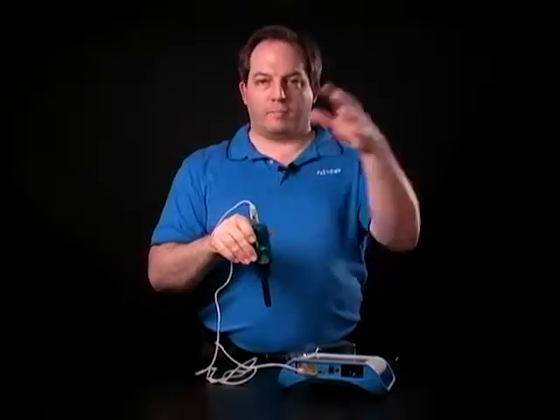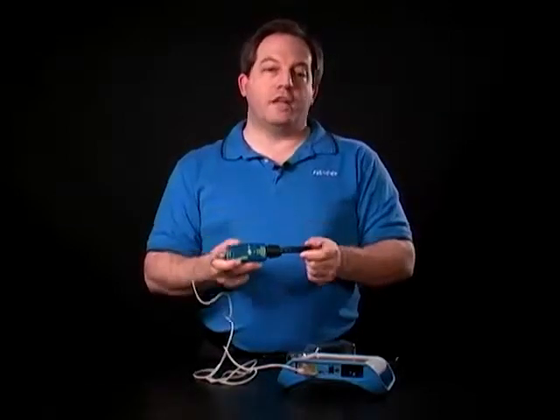Always try to keep the sensor away from bright lights. Other than that, it's a great sensor to use for biology, and I think you'll have a great time with it. Don't forget to practice safe science.